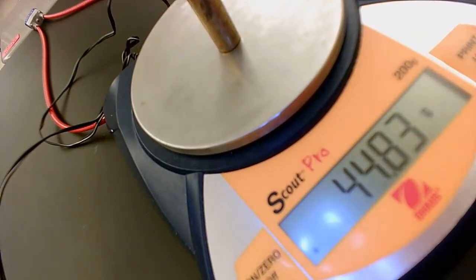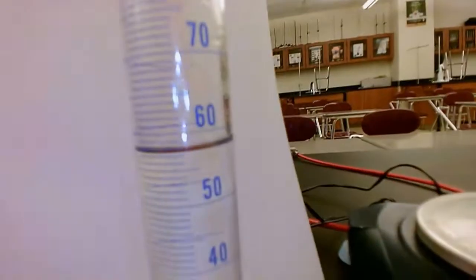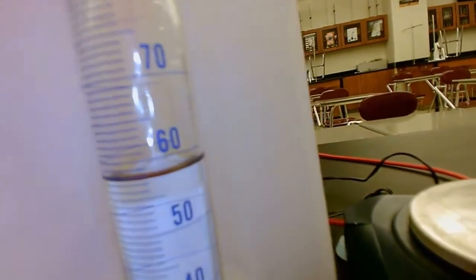Okay, so next thing we do, we get the volume. That's our initial volume. That's the volume of just the water.